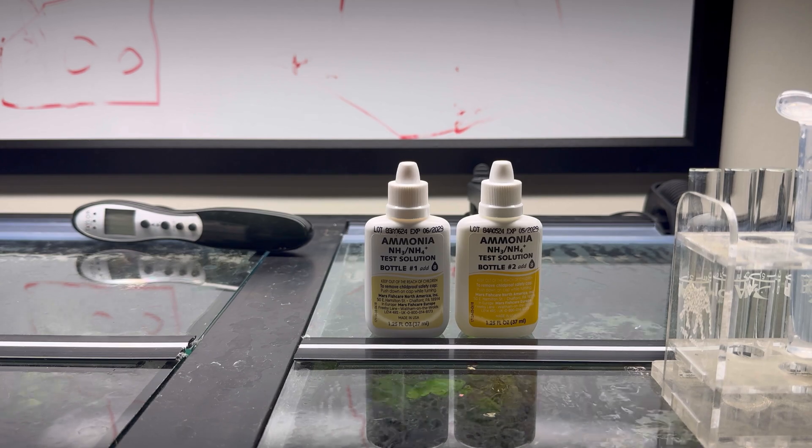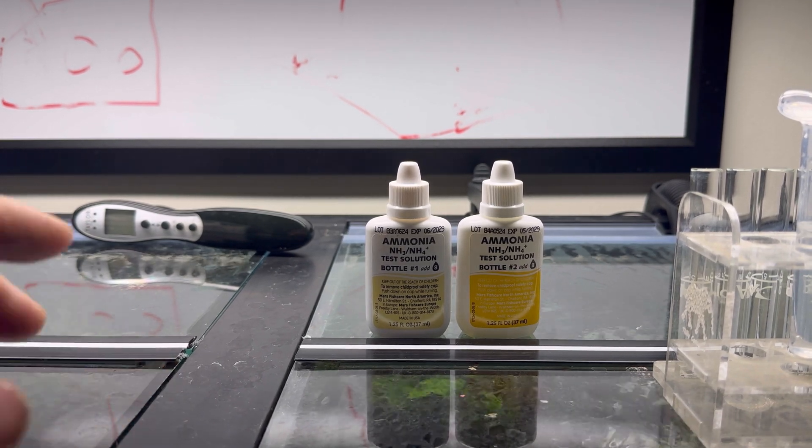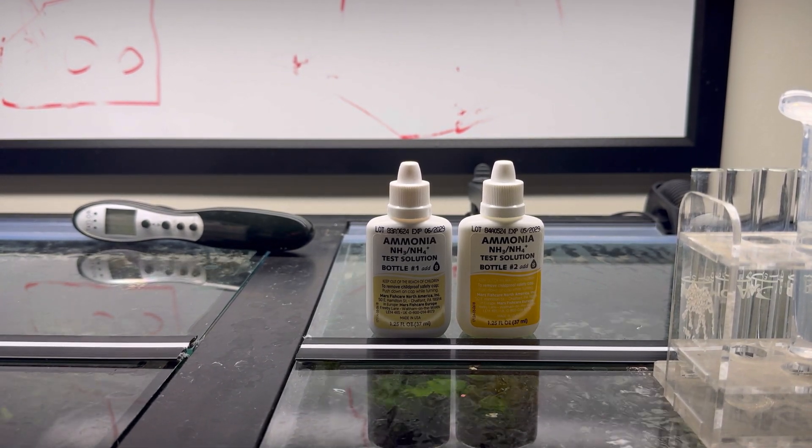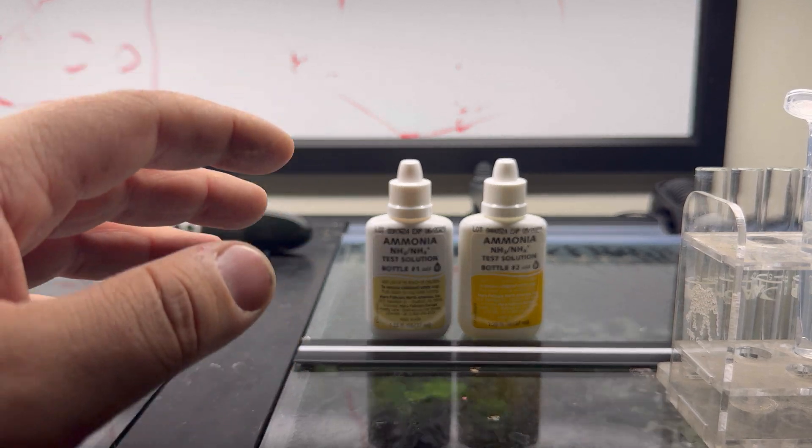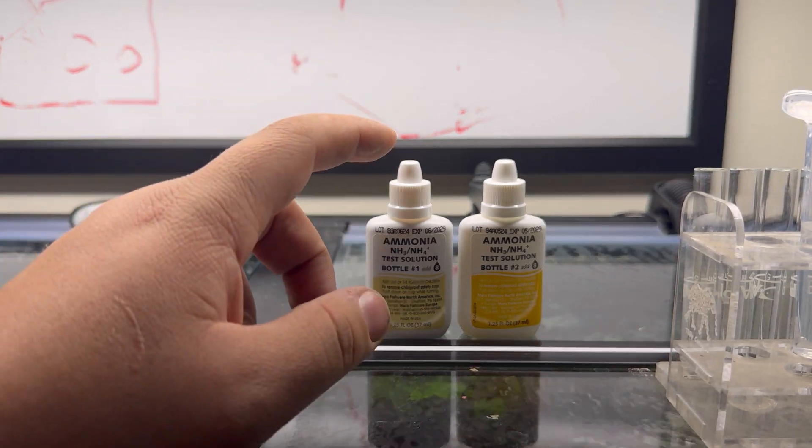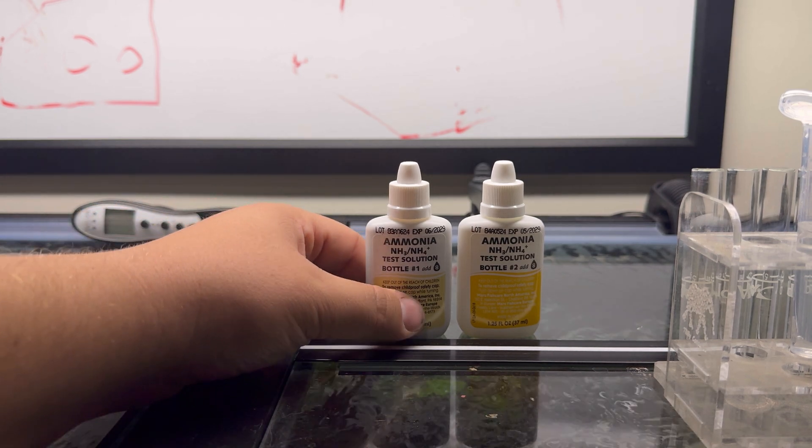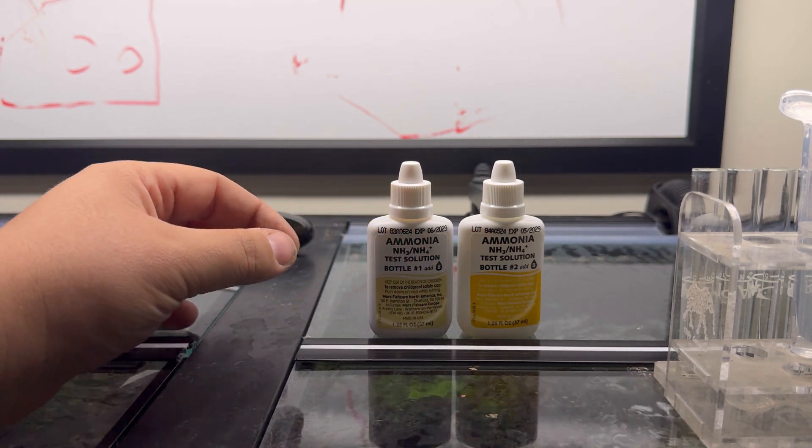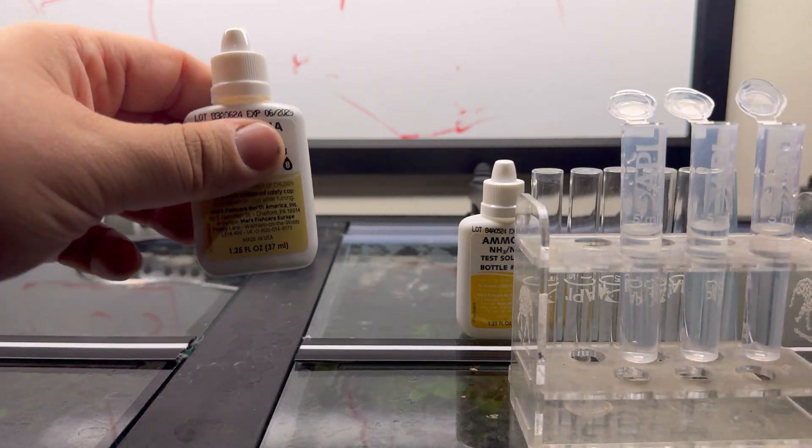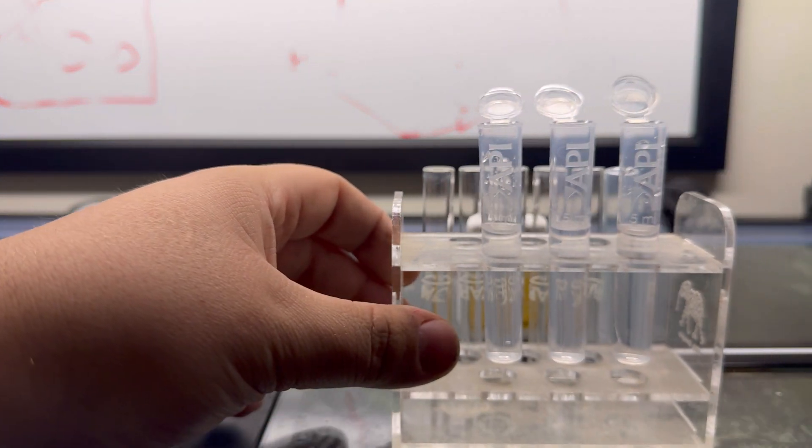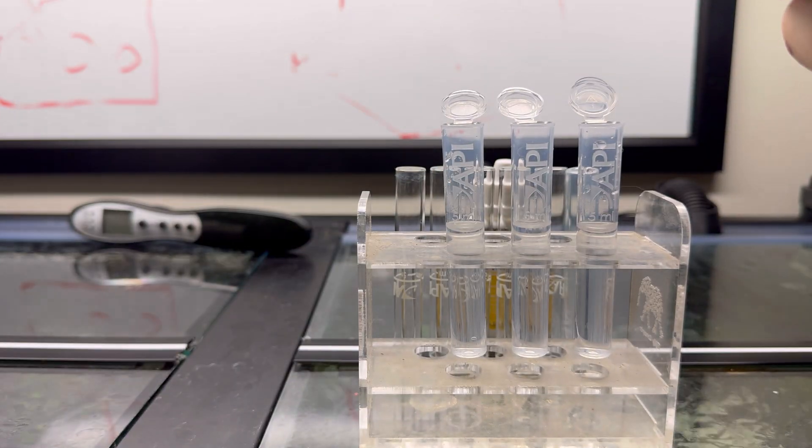Our first test today—you can do this in any particular direction, but I like to do ammonia, nitrite, and then nitrate. Ammonia is a two-part solution, bottle one and bottle two, both requiring eight drops individually. I like to always give mine a quick shake. We're going to do this from left to right.